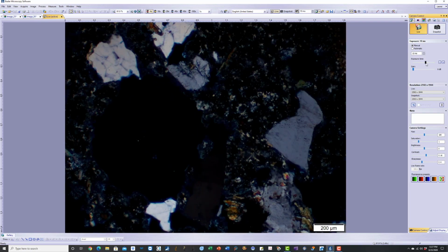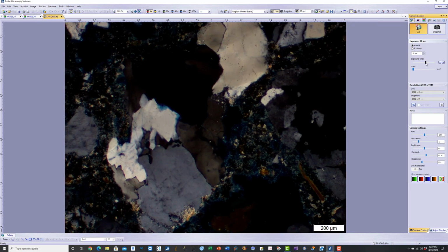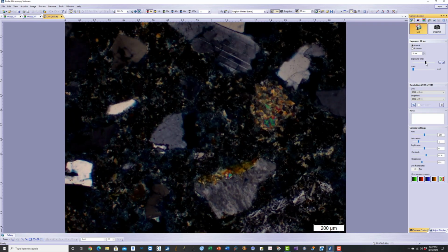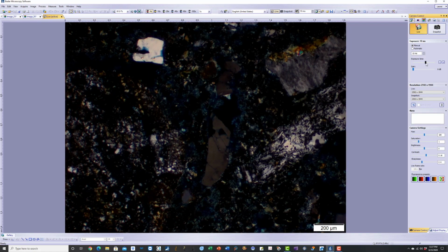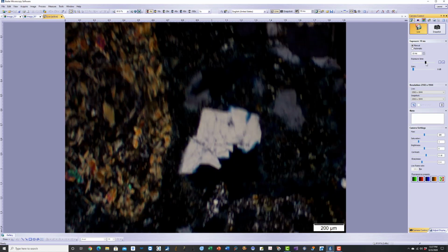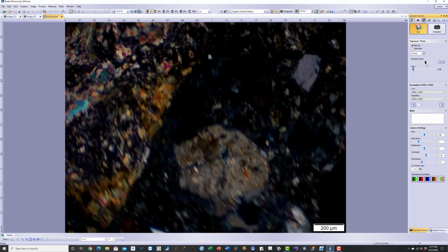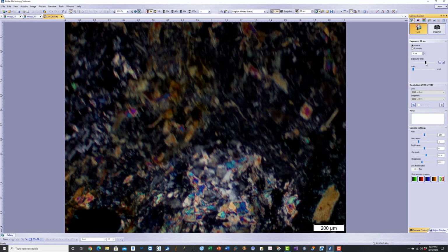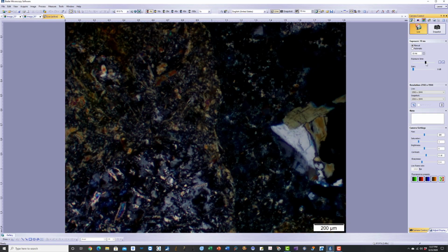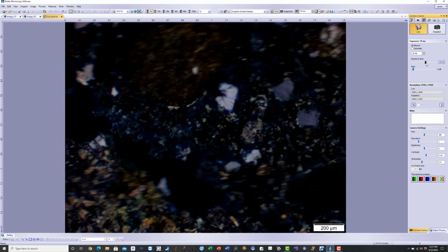There are very few basalt in this particular sample, but in many other concrete samples from Puerto Rico, you see basalt as the ubiquitous aggregate, depending on the aggregate source.